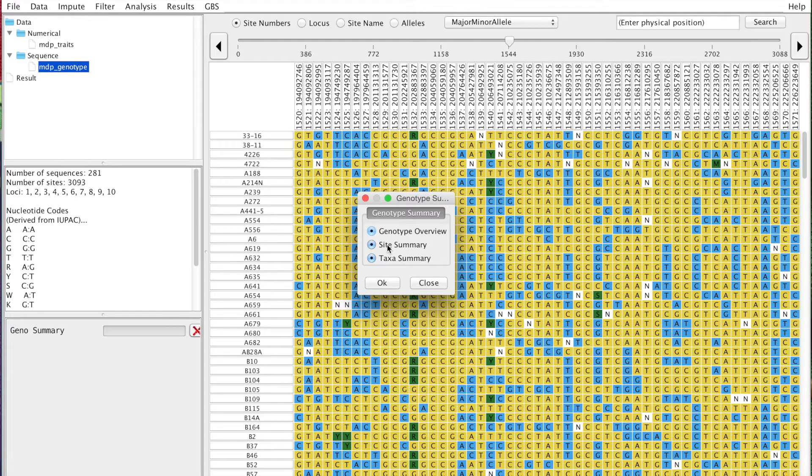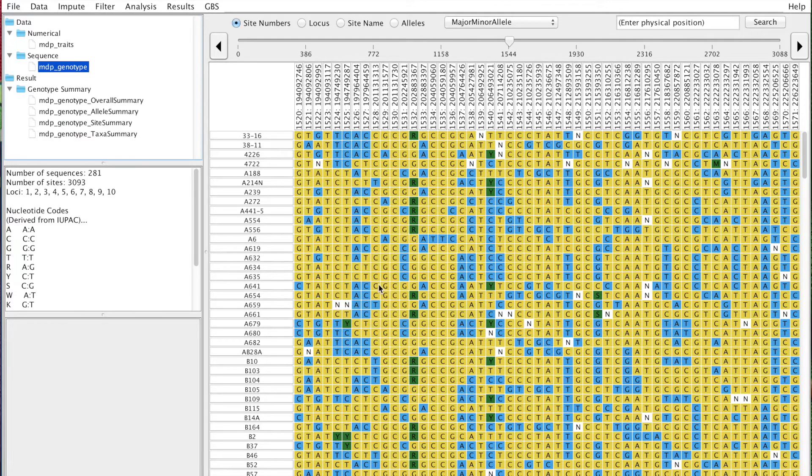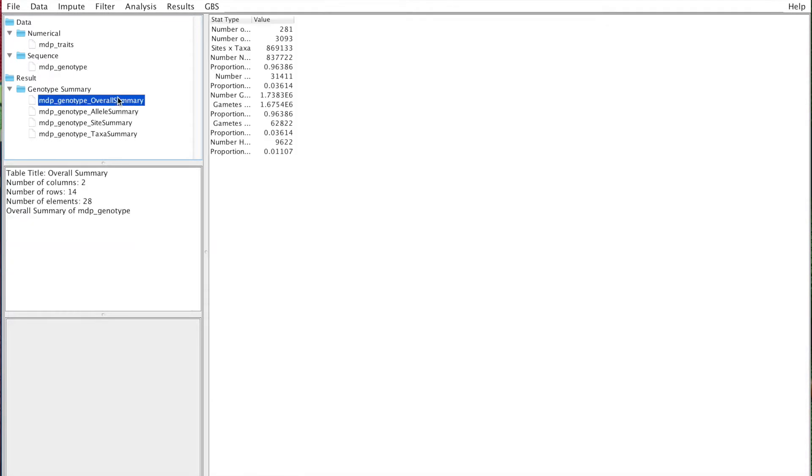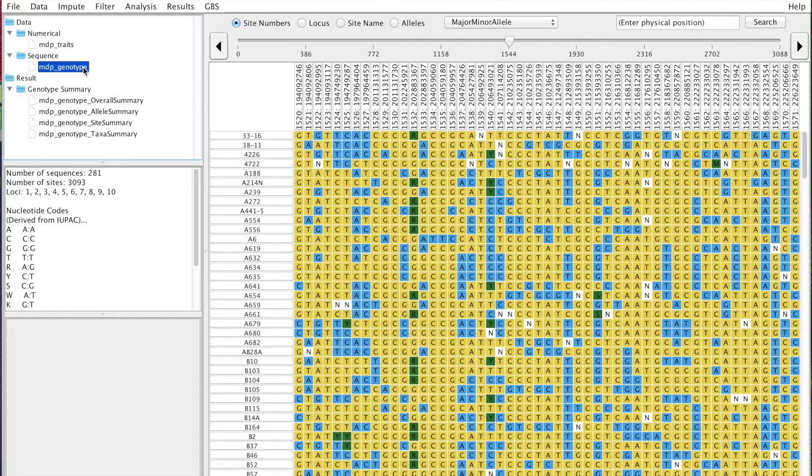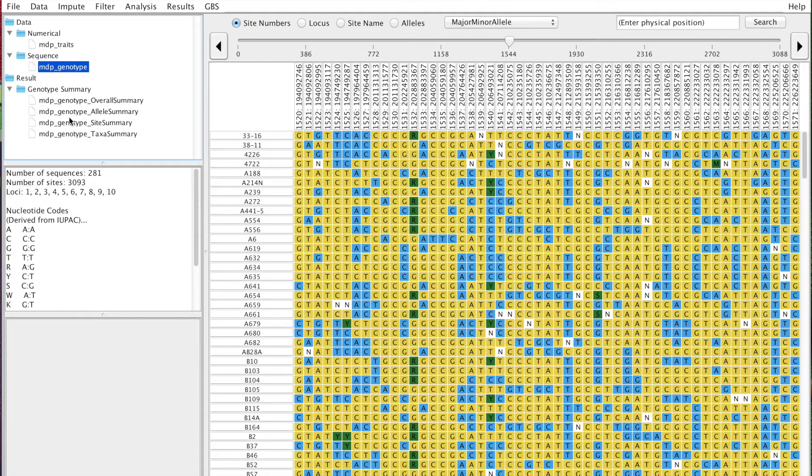go through each of them with you, and then you can decide which ones are more meaningful. This is done. I'm going to start with the overall summary. First, you're going to have the number of individuals and the number of sites, and then the number of sites times the number of individuals. An interesting thing is that you already have that here.